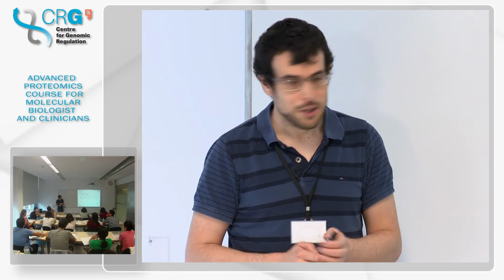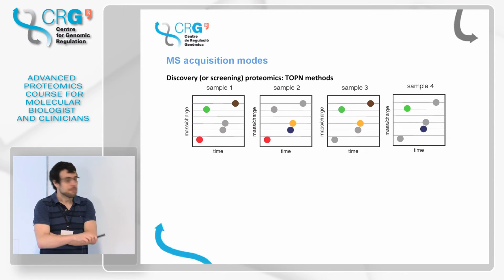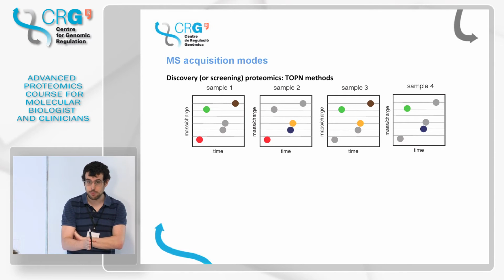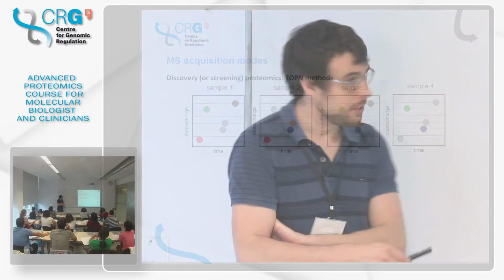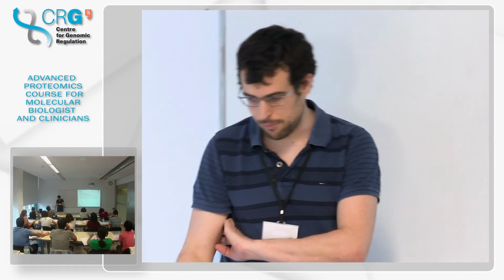Okay. Do you have different samples, or the same sample but different replicates? Well, this I made up, meaning that I made the slide, but this could be both things, either biological replicates or technical replicates. And this sampling effect, you would see in both cases. Okay, so no matter whether they are technical or biological replicates.